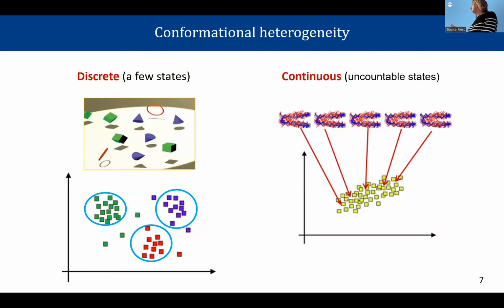So then if you are able to get something like this, based on the density of these points, we can then group conformations, which means images that come from similar conformations, meaning close to each other here in this space, into average 3D reconstructions, and get these different states at high resolution. For this, we need a lot of points here, meaning a lot of particle images.